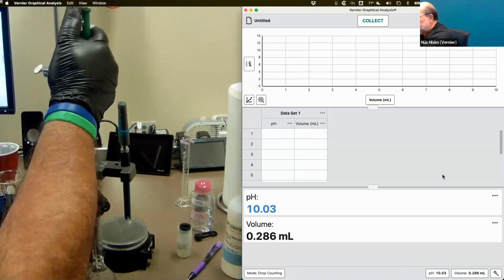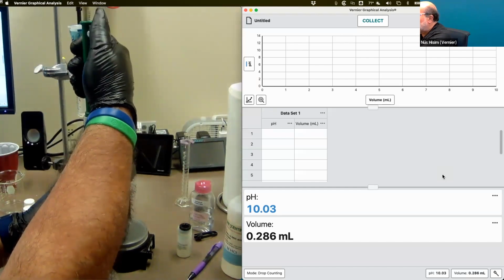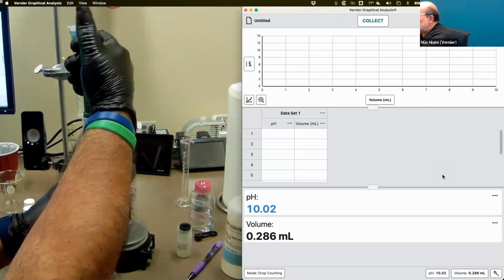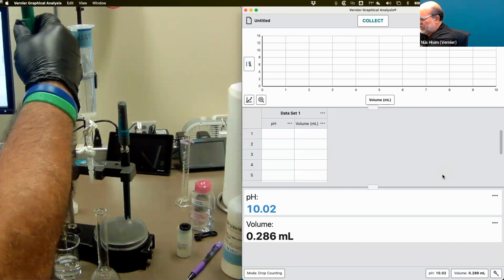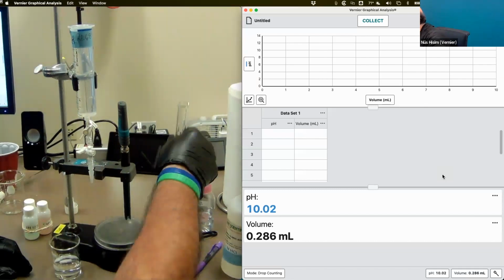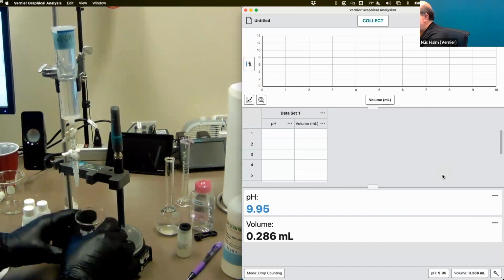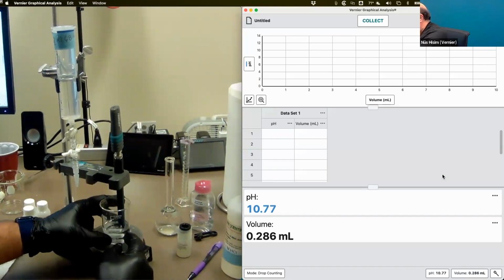We use beakers, not flasks, because the top is larger, which makes it a little easier to hit the spot. With flasks, it's a little hard to hit the spot. So there's the 5 milliliters of basic diluted crime scene evidence. So now what you need to do is a little adjusting here, right? We're going to have to get the pH probe down into the liquid.